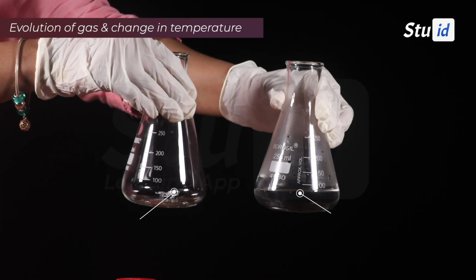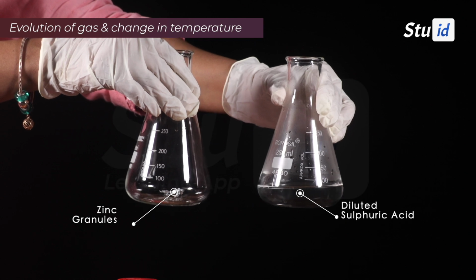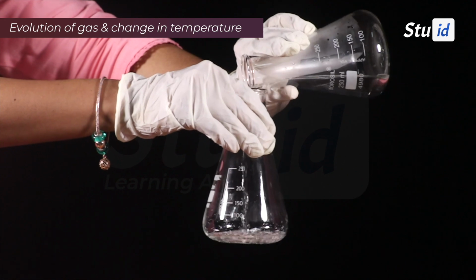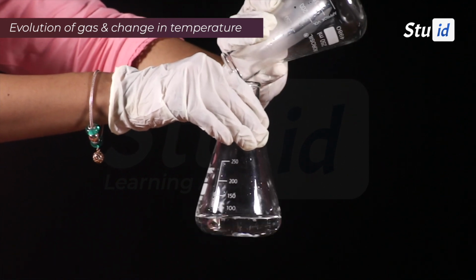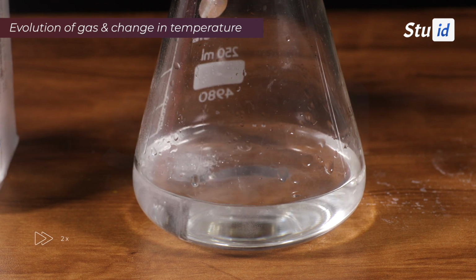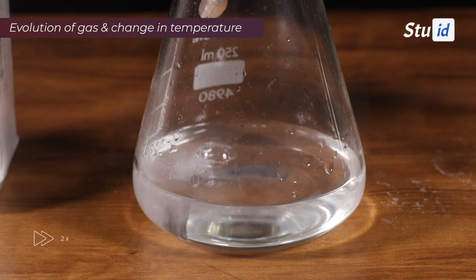Now we'll move to another example which shows that evolution of gas and change in temperature occurs in a chemical reaction. Now let's see what's happening. For that, we'll take a conical flask and we'll add a few zinc granules to it, to which dilute sulfuric acid is added slowly. What can we notice? We can notice that bubbles are evolved in this solution, which is in the conical flask.